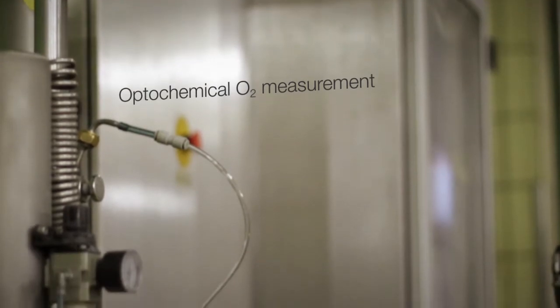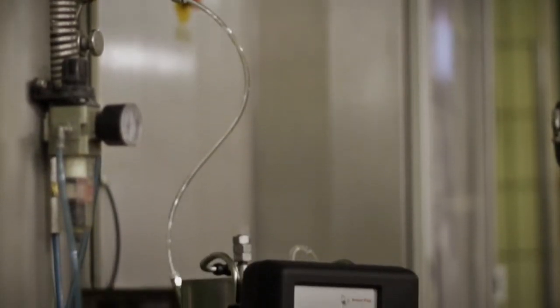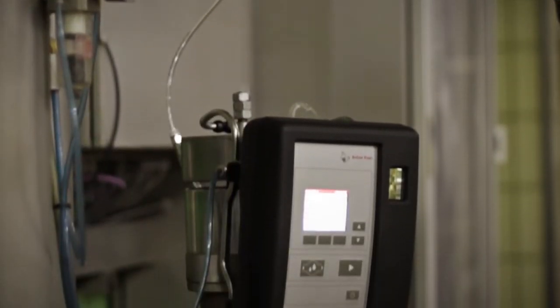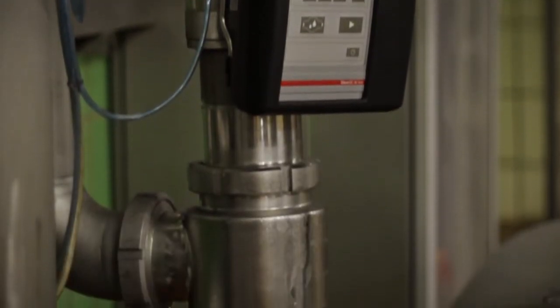The oxygen sensor is based on the optochemical principle and guarantees fast and highly accurate determination of dissolved oxygen.